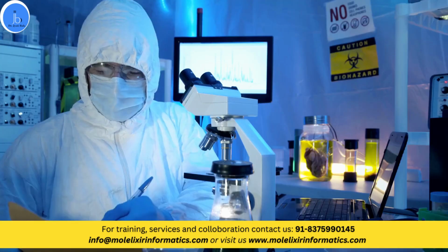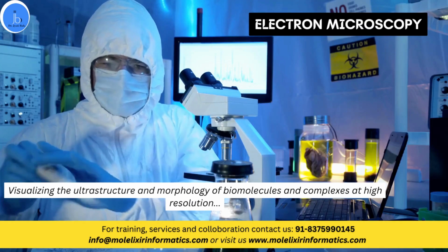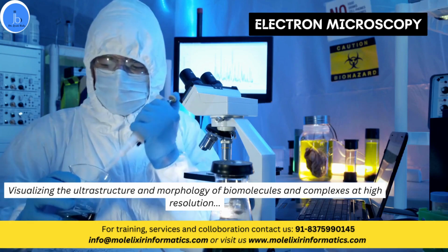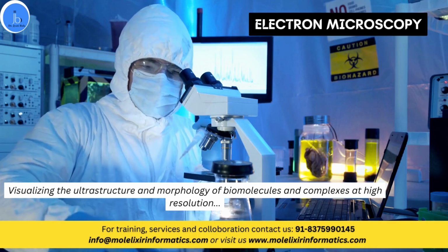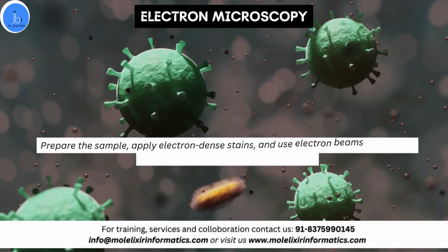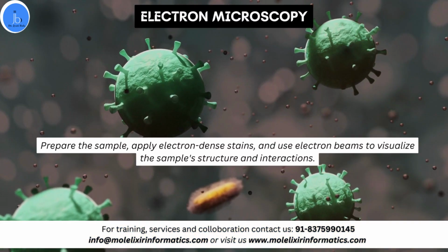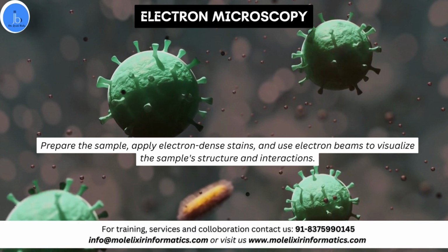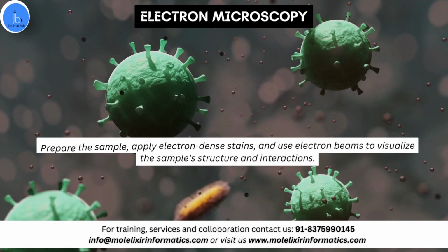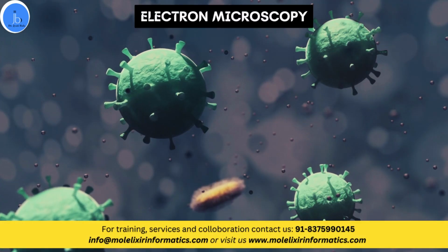Adding on the list, the next technique is electron microscopy, which visualizes the ultrastructure and morphology of biomolecules and complexes at a higher resolution. Usually, this technique involves preparation of the sample, then applying electron-dense stains, and using electron beams to visualize the sample structure and interaction.